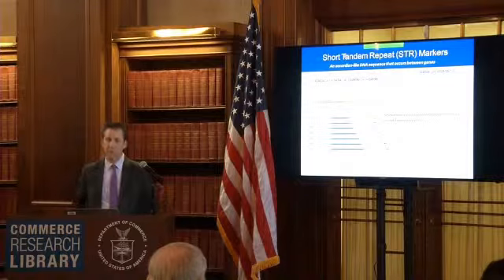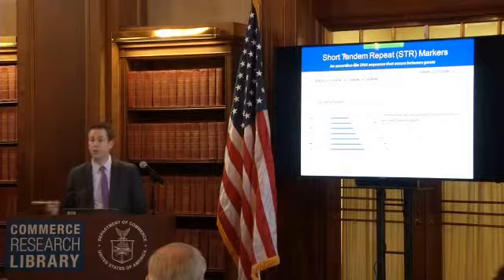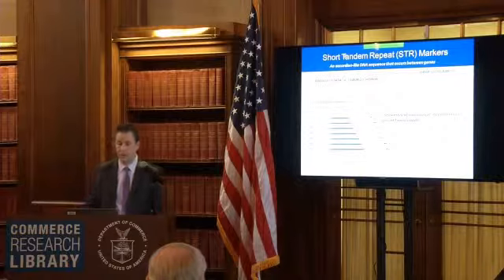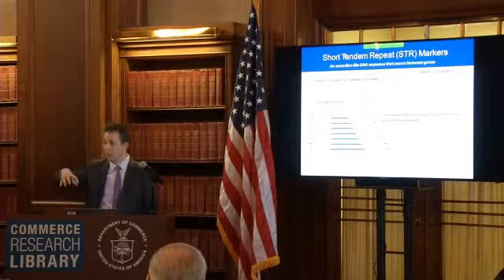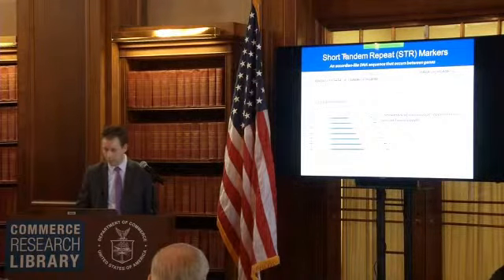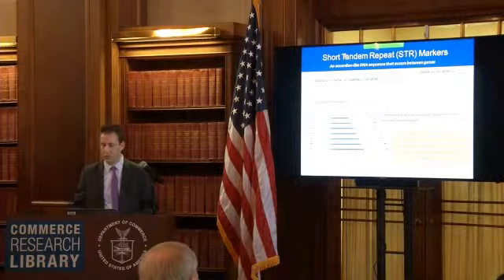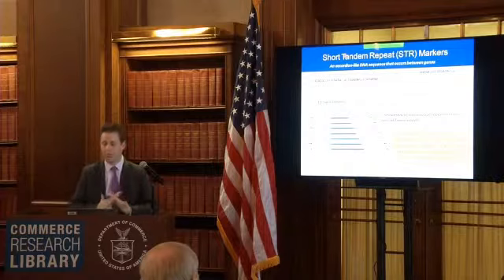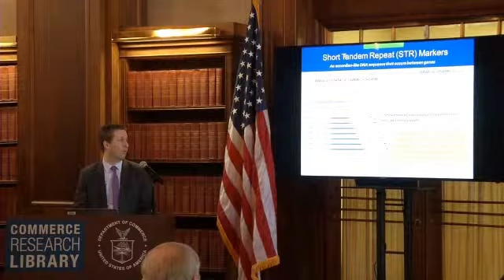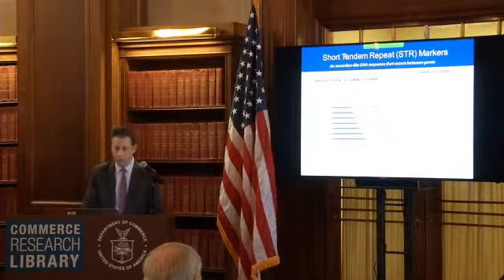So you can think about it in a population of individuals, the number of consecutive repeat units can vary between people. The reason that these markers were selected in the first place is because they are shown to be variable in a population. So one person at a specific area of the genome might have 7, someone else might have 10, someone else might have 13, and so on. The idea is that the frequency or the occurrence of those repeats or alleles observed in the general population, they've been sampled, the science has been done here, and then they're used in the statistical representation of a DNA profile.